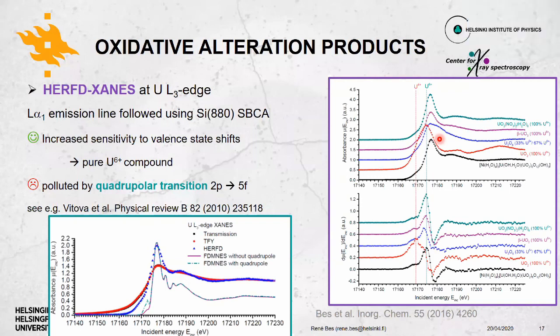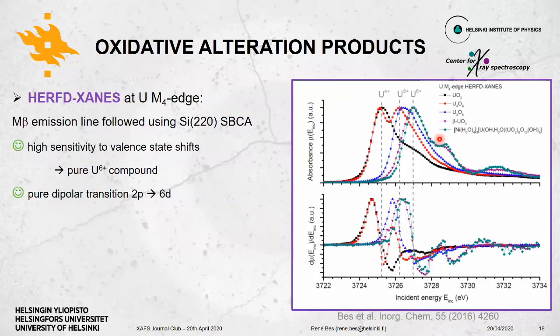Actually, yes, this nonlinear behavior of the 5f position is mainly due to the interaction of the f electrons and hybridization with the 6d and the oxygen 2p as well, depending on the compounds. You have splitting of the 5f electrons for uranyl-type bonding.